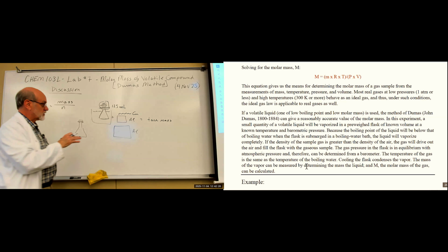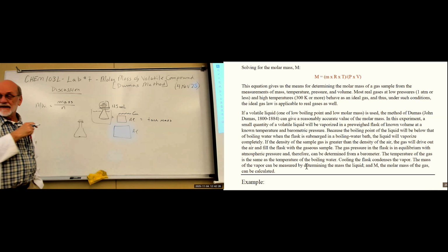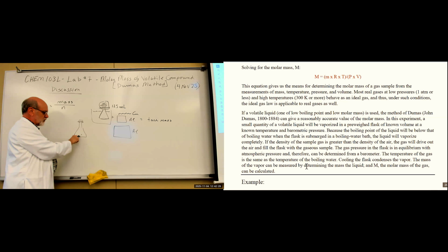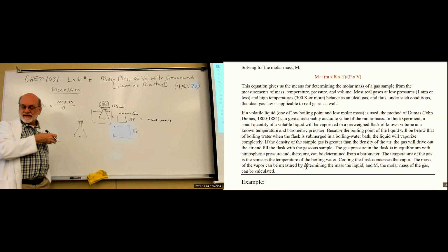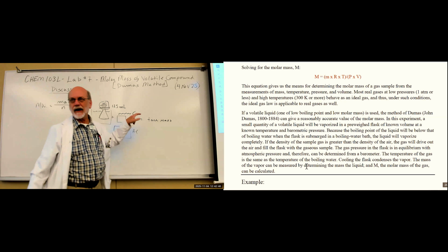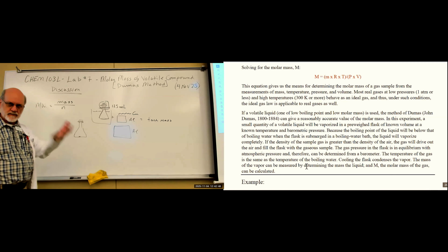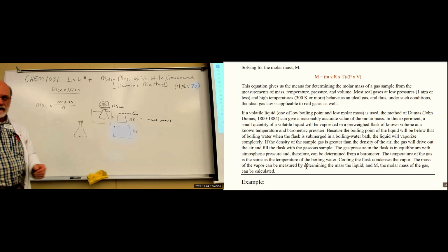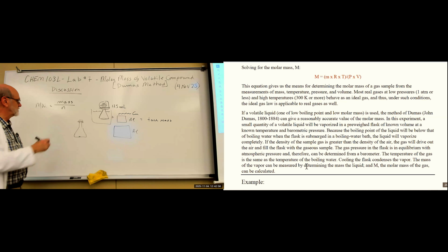And that's okay because we've already got the mass over here, which had air in it. So all we have to do is ignore that little bit of volume that the liquid takes up as it refills with air. Now the tare is actually the flask, aluminum, copper, and air. So now we've got the air back in here and we've got this liquid. Once it comes to room temperature, you can weigh it again, and the difference between the two is going to be the mass of that gas. So we got the mass.